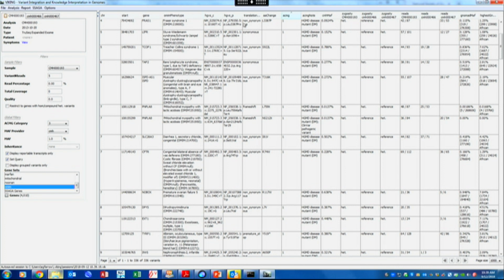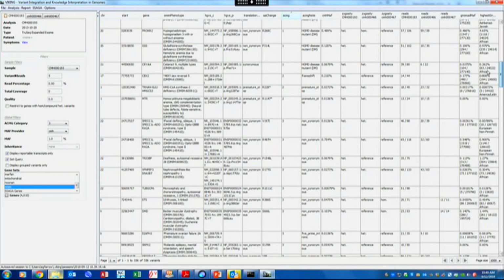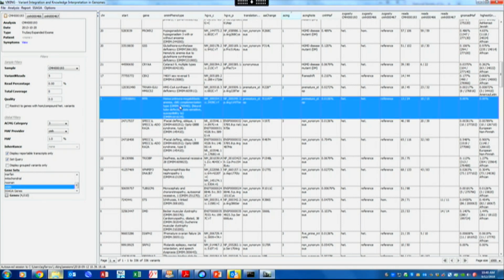If you kind of go down the list, so if it looks like this is a lot of work to go through all of this, it is. I mean, it can take you a whole day to do an exome if it's a difficult one. So yeah, we're taking applications. So if we go down here, you can look at the CAT2s. So, a lot of these you could dismiss, and again, it's familiarity with the genes in the genome, and you don't know every single gene in the genome. We've been doing this for years, and we still don't know every gene in the genome.